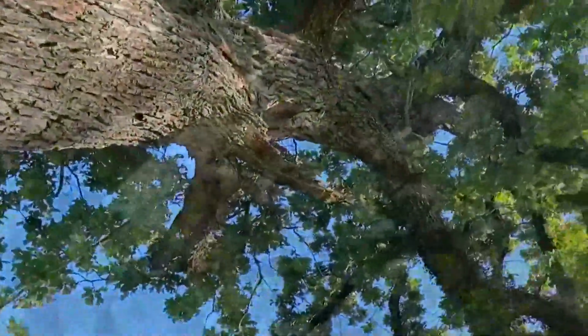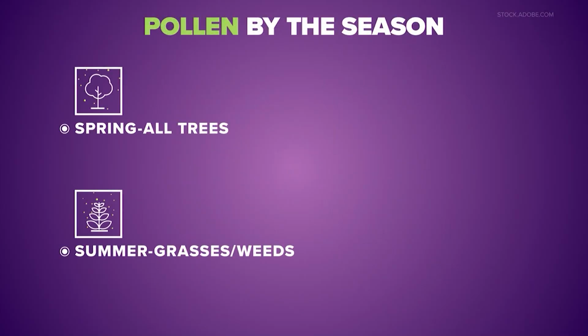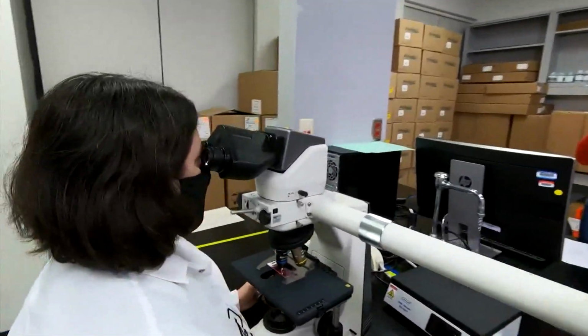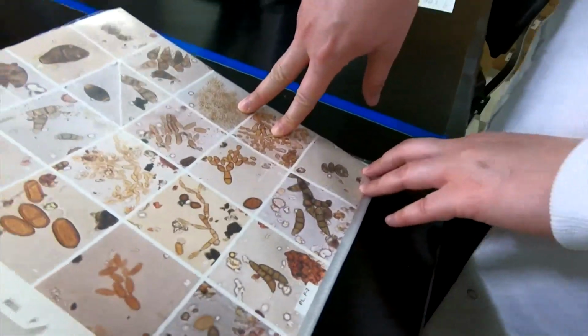Pollen. I want to say it's this time of the year, but it is all year in Southeast Texas. You see the reports, you read the numbers in the categories, but how do we get these numbers? As a meteorologist, I can tell you about a wind shift or the change of pollen per season, but it really takes a microbiologist to break down the numbers. These are one of the big ones. These are cladospores. Enter Christina Utz from the Houston Health Department.